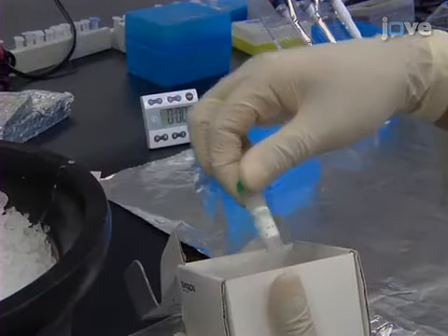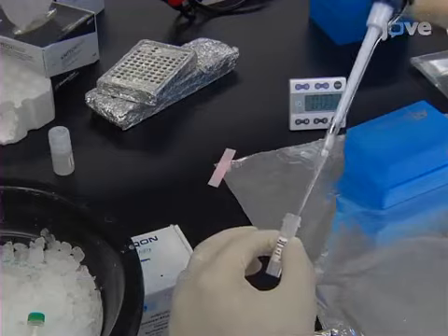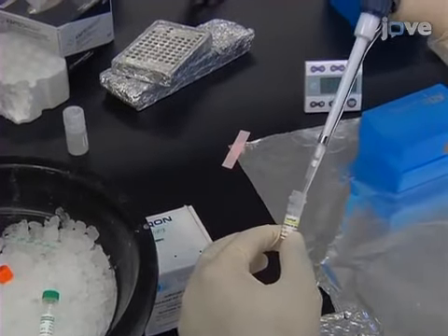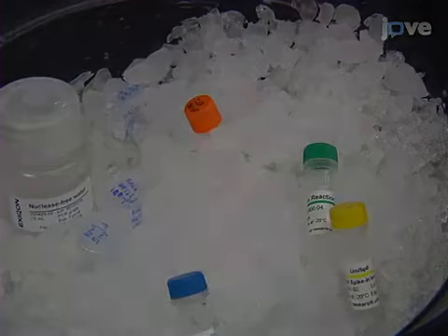Next, gently place the 5x reaction buffer on ice to thaw. Then, add 40 microliters of nuclease-free water to the RNA spike-in to resuspend the reagent. Vortex the tube and leave it on ice for 15 to 20 minutes.